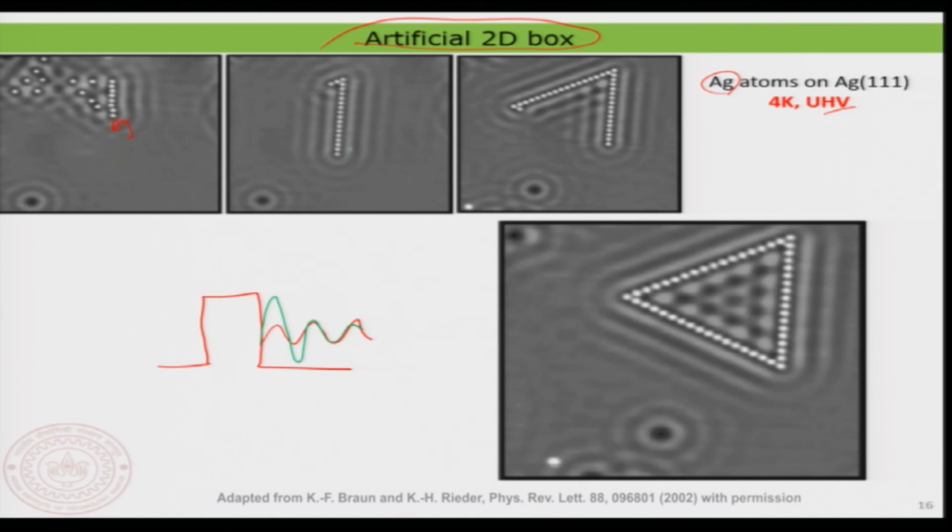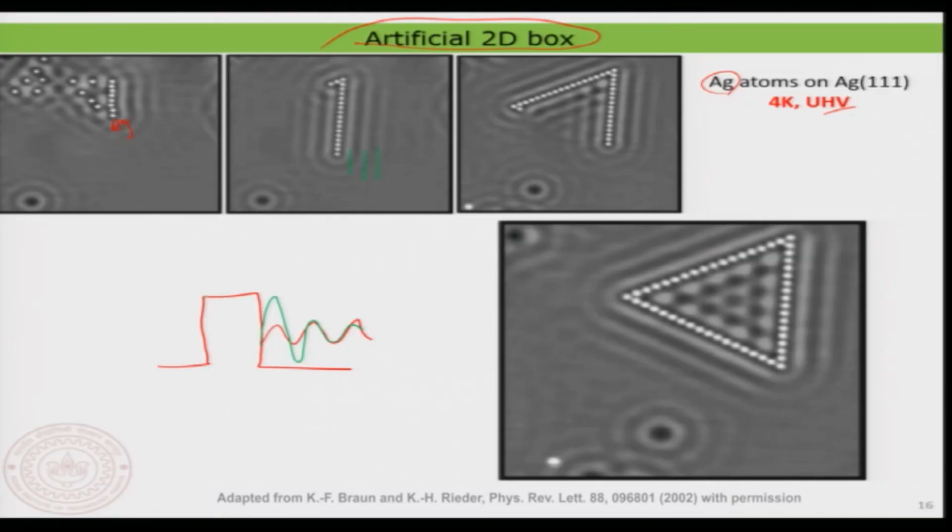That is also the reason why you see here a ripple of wave, a kind of standing wave that reflects from the atomic chain. That is the electrons that are bombarding the chain of atoms, and they reflect back. So ideally what you are visualizing is a standing wave of electrons that is created at a barrier. This is again a barrier, because these are the atoms acting as a barrier for the incoming electrons. So you can now create two such atomic chains, and what you clearly see is that these two standing waves of electrons start to interfere.